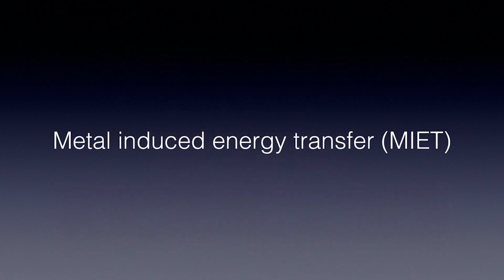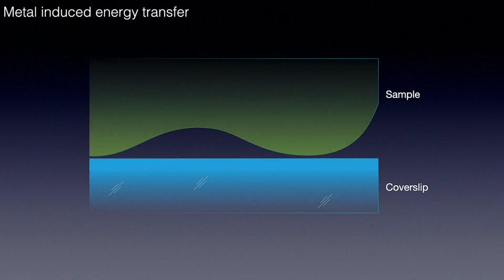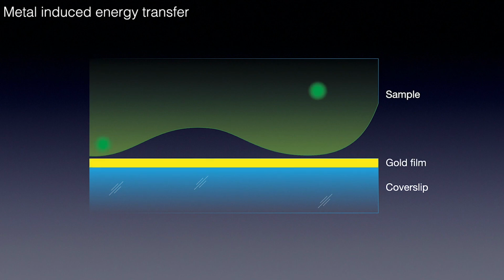Another application we would like to show is metal-induced energy transfer, or MIET. Here we have a fluorescent sample with some chromophores inside. If we cover the glass surface with a thin layer of metal, we can exploit timing to perform axial super resolution. Here the lifetime of chromophores is reduced because of the quenching in a similar way to FRET, but instead of acceptor molecules, the energy is transferred to the electron plasmon formed by the film.